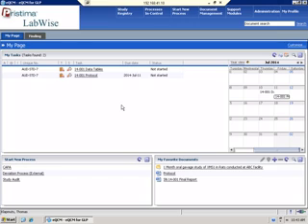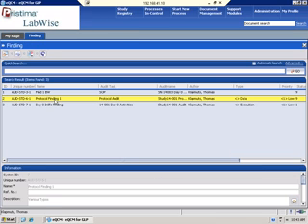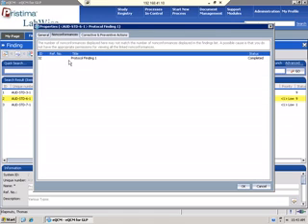So that's going through the audit, the findings, CAPA, again, nonconformance. Same thing if we look at any findings we have. So this one here, if I look at it, it has a finding. Again, all the metadata, the type. And then here we see it had a nonconformance. And so we can go look at the deviation or the nonconformance process. There were no CAPAs associated with it.